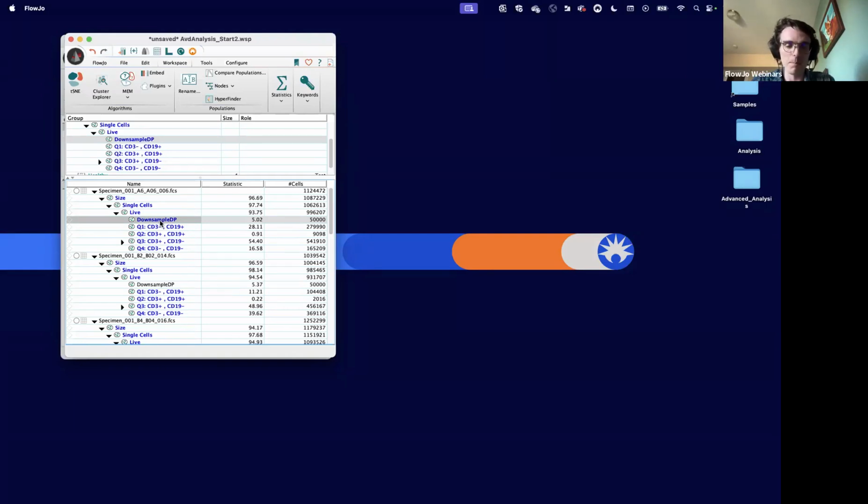Now I'm going to go ahead and combine my different samples together. I want to concatenate the data so I can do machine learning on the combined data, because most machine learning works best if I hand the algorithm a representative subset of all the cells. That way it's able to do its analysis on all the different conditions in cells and populations and generate results that way. Again, FlowSOM has an apply on map feature.